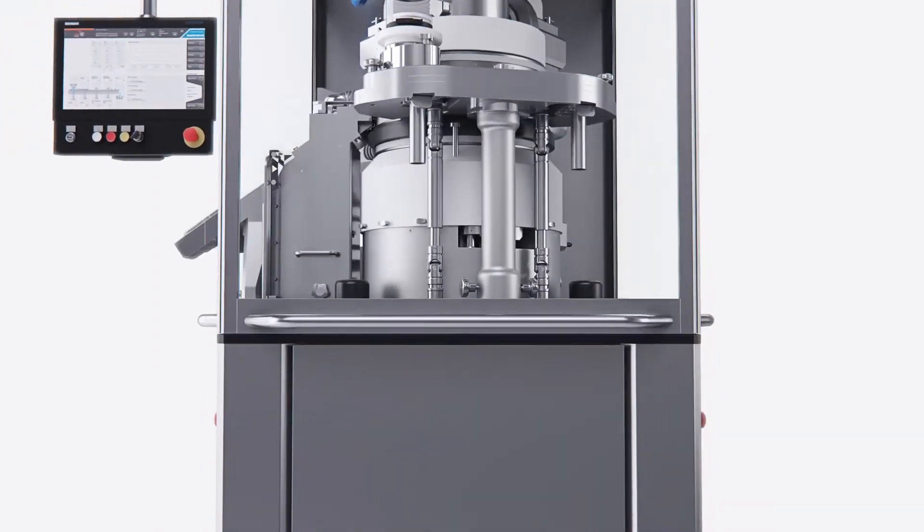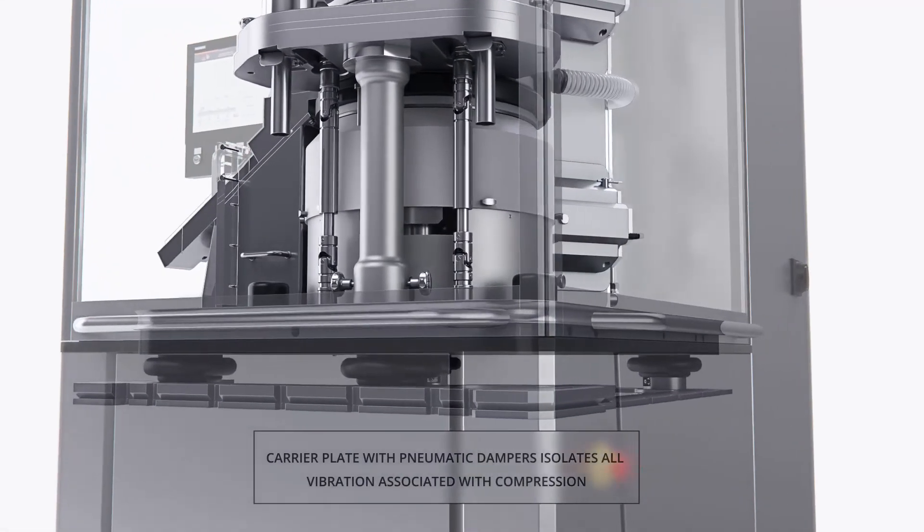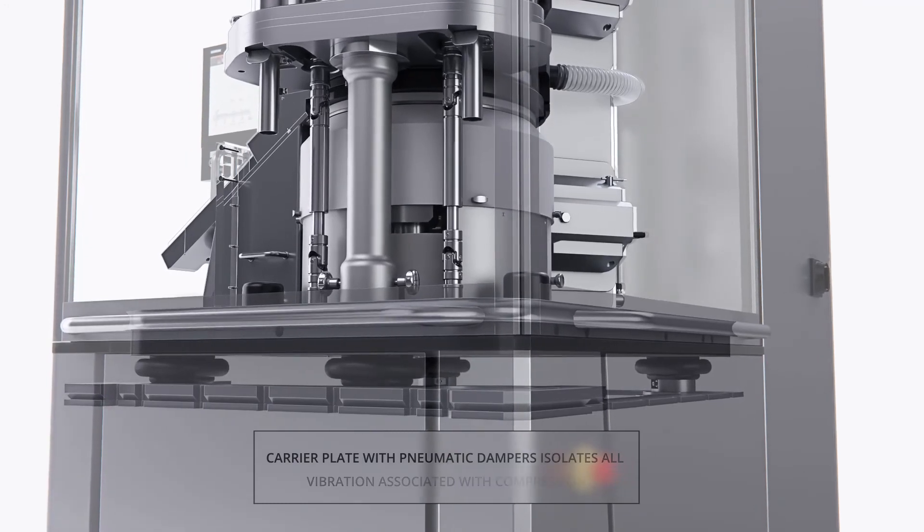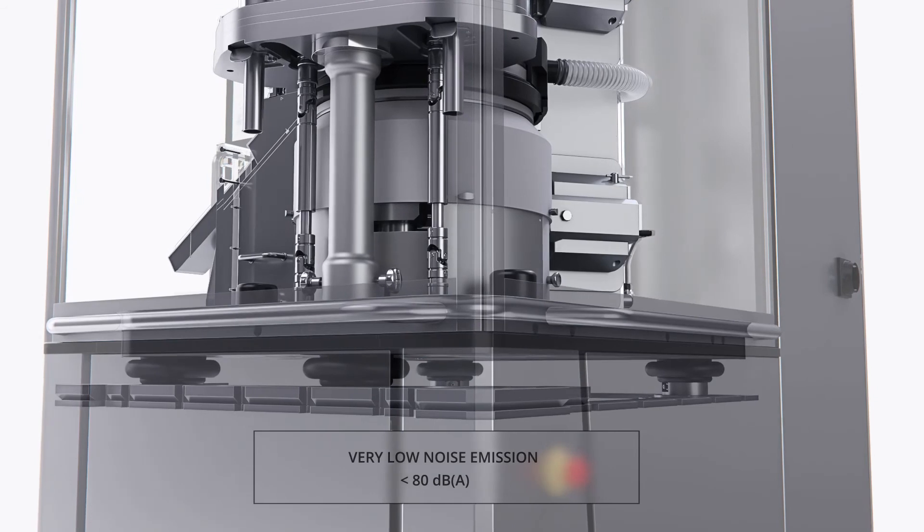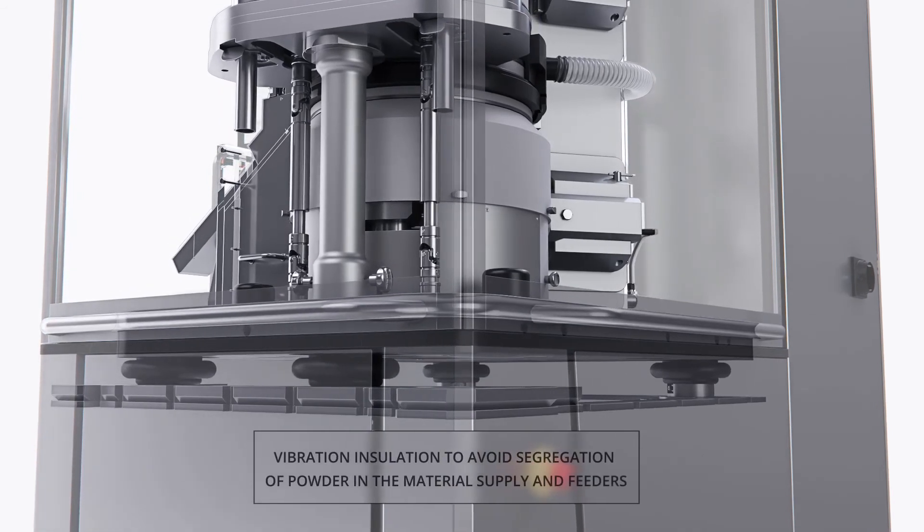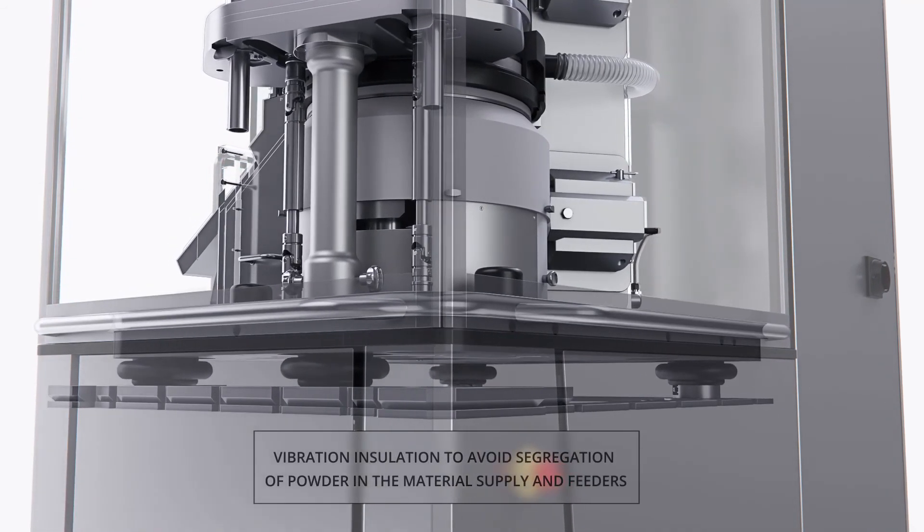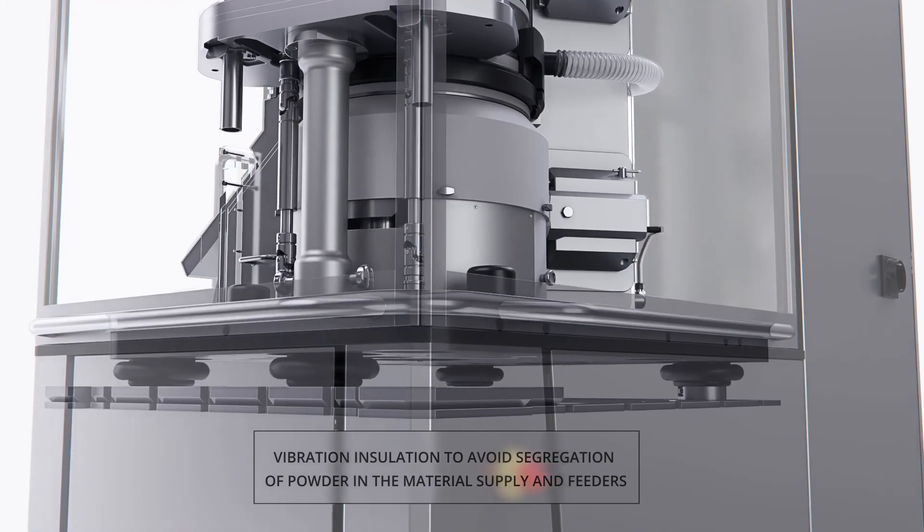The carrier plate that supports the dual compression column is mounted on pneumatic dampers. This unique and patented design fully isolates vibration from the headpiece and machine base. The result is an extreme reduction in operating noise level.